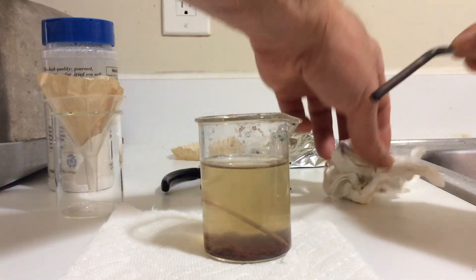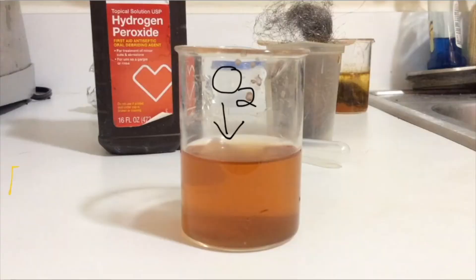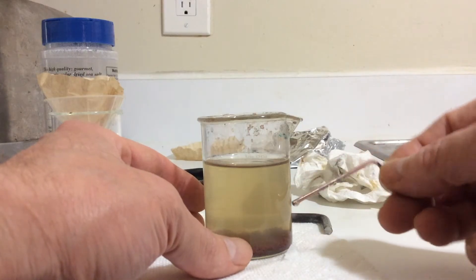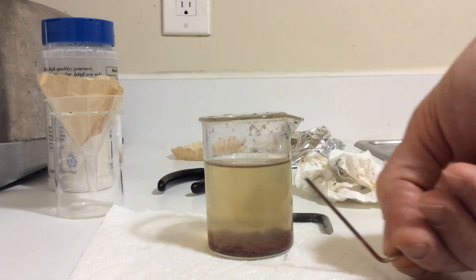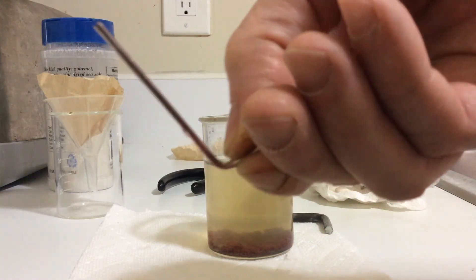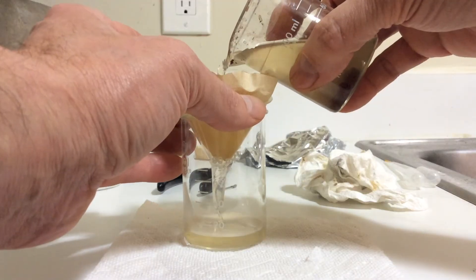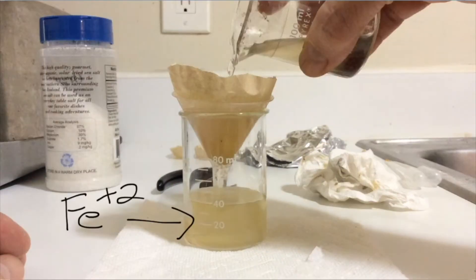Over time the iron(II) ions will oxidize when exposed to air to iron(III), which is going to be a darker red color. I put in a very clean piece of iron to make sure I got all the copper out, and I think it's pretty much gone. Filtering the solution makes it look really nice — looks like we got a pretty good haul of copper.